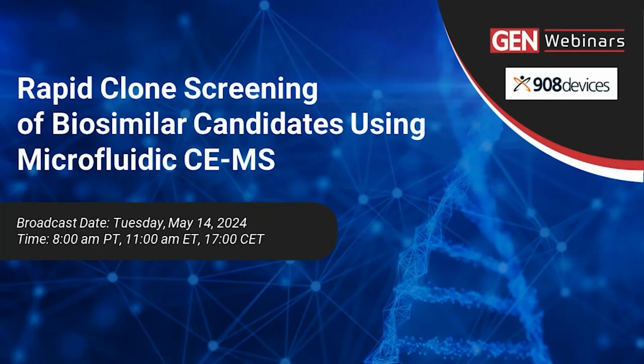So what are the key takeaways from this webinar? Well, you'll hear about microfluidic CEMS technology basics and applications. You'll hear about the benefits of combining charge variant separations with mass spec characterization. And you'll hear about how this technology is an asset for rapid clone screening of biosimilar candidates in the biopharmaceutical industry.